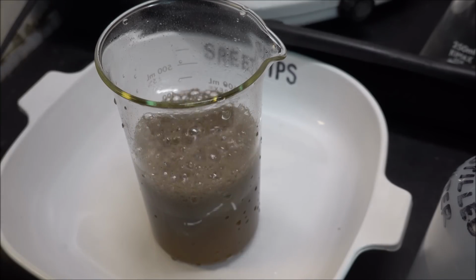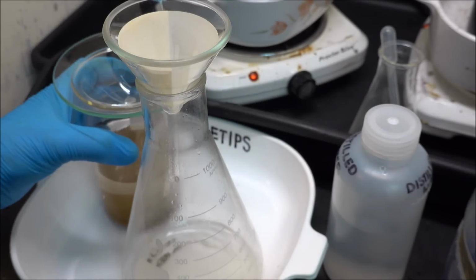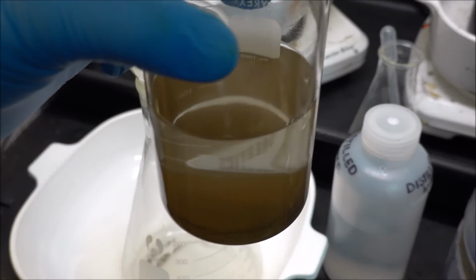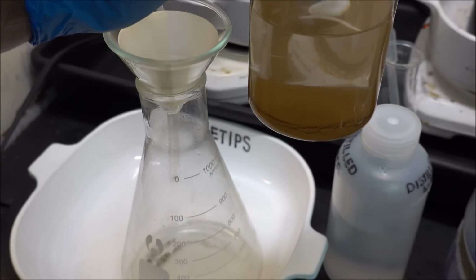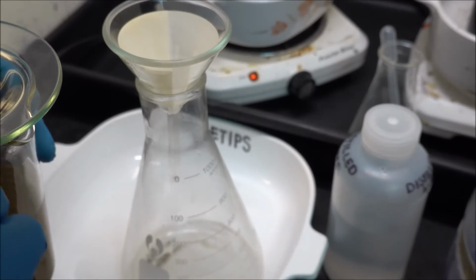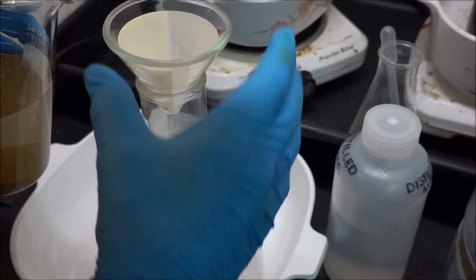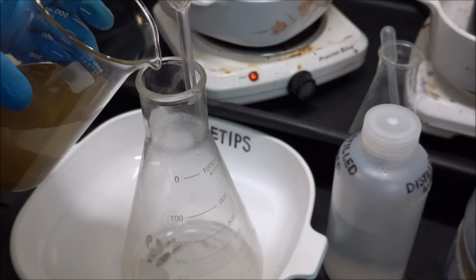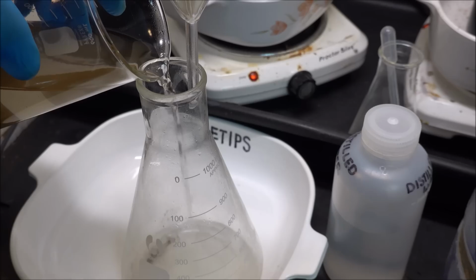Just about do it. Gold has been allowed to settle now. It's got a nice tan brown color to it. What I'm going to do is pour off this waste solution into this container. This waste solution will be added to my stock pot later on.